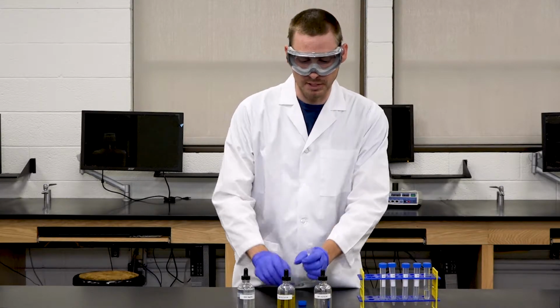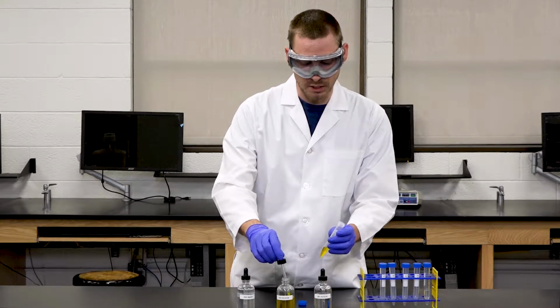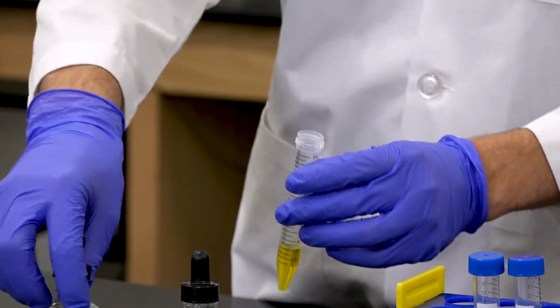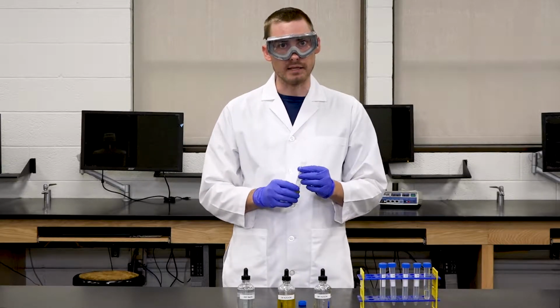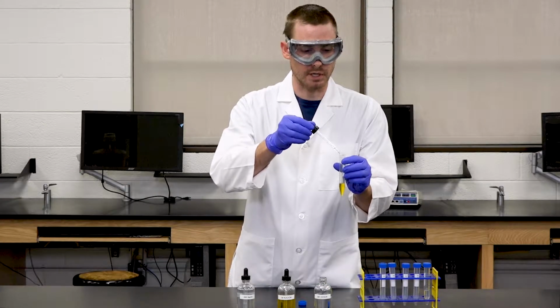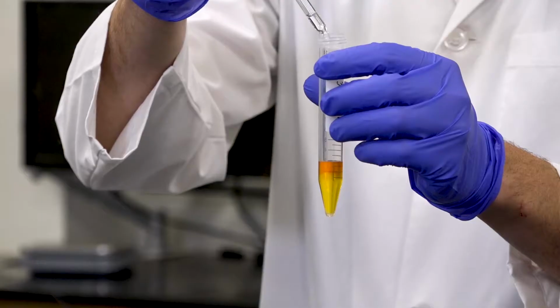First, you'll need to make sure that you fill up this test tube with the yellow solution, which is potassium chromate, to the correct level. And then next, we're going to be adding sulfuric acid, and this color will turn from yellow to orange. So we'll add a couple of drops of sulfuric acid to the chromate solution.